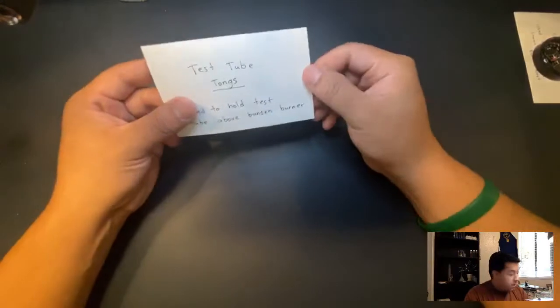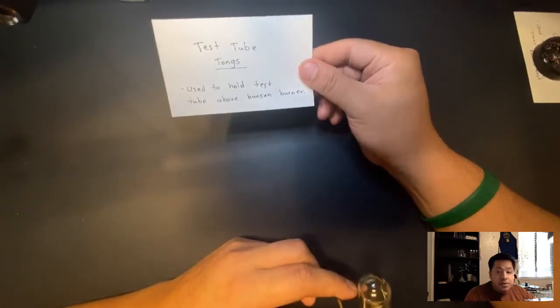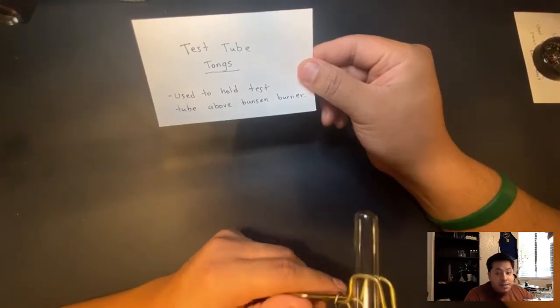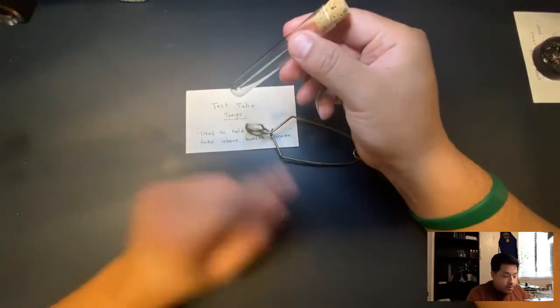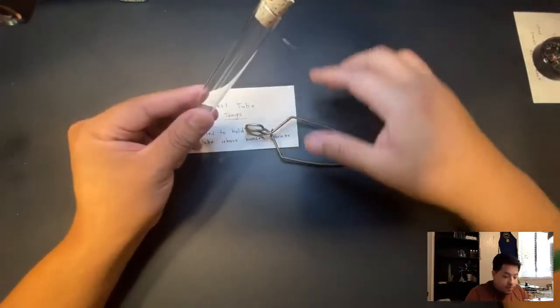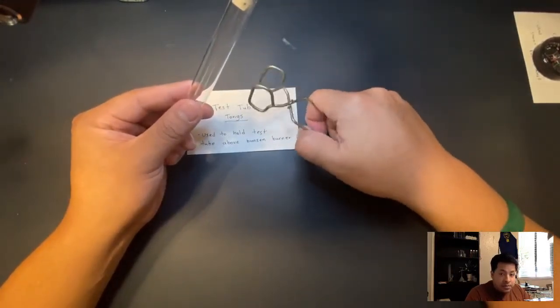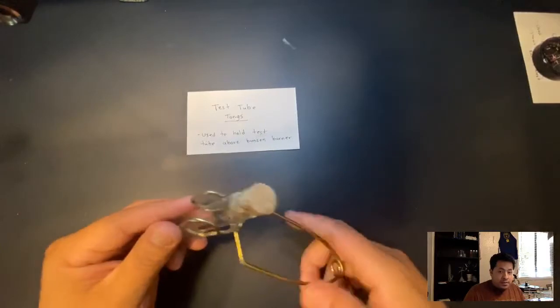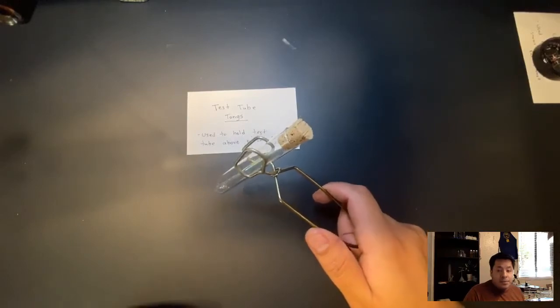Next we have tongs. We're probably not going to use these too much in the science lab but we're going to talk about them. Tongs are used to hold test tubes above a Bunsen burner. Instead of holding the test tube with your hand when heating a solution, you grab tongs, give it a good squeeze in the middle, and hold it above the fire.